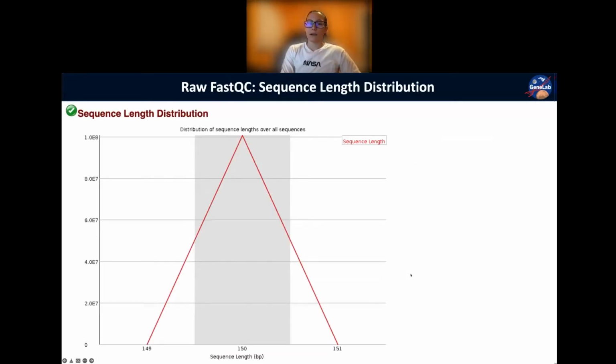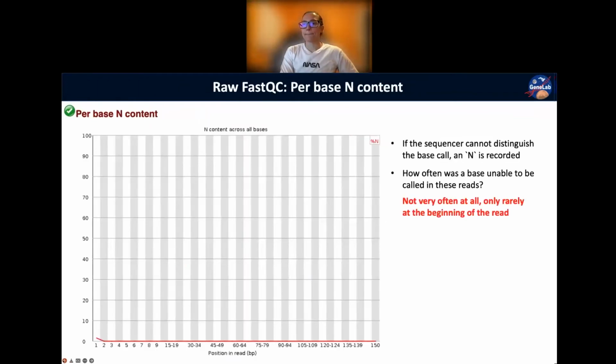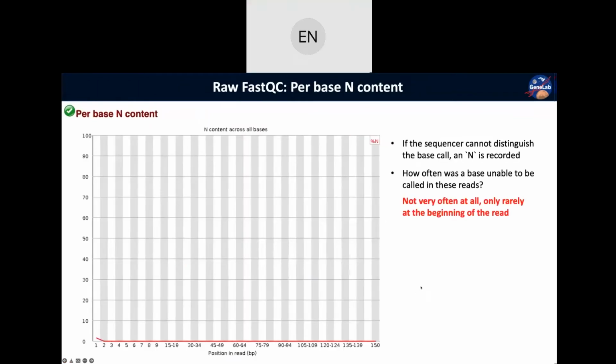So Amanda, the base call is made on some kind of signal-to-noise ratio, a fluorescence detection parameter, right? This base, there may be other fluorescence. So is that a parameter that you can set? Is that something that the person who's running can manipulate? Or is the detection of the base call done by an algorithm?